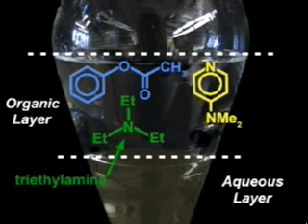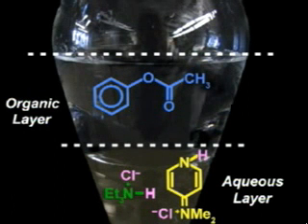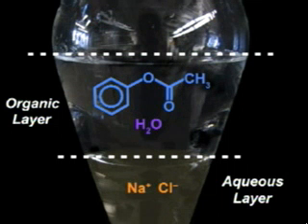To get rid of the weak bases triethylamine and DMAP, wash with a dilute solution of a strong acid that will protonate the bases and pull them into the aqueous layer. A 10 percent aqueous solution of HCl works well for this. Add the wash and mix and vent well. Drain the aqueous layer containing the protonated amines, and repeat two more times. Water is slightly soluble in ether, so one way to pull some of the water out is to wash with saturated sodium chloride, otherwise known as brine. The high ionic strength of the salt solution decreases the solubility of the aqueous layer in the ether, effectively washing away some of the water.